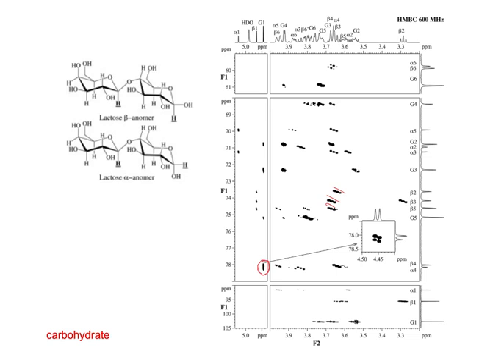this one right here, is going from this G1. So here's G1, and it's going to probably both of these, beta 4 and alpha 4. So if we count both alpha and beta, 1, 2, 3, 4, this is the coupling from here over to here. So it's a 3-bond coupling.